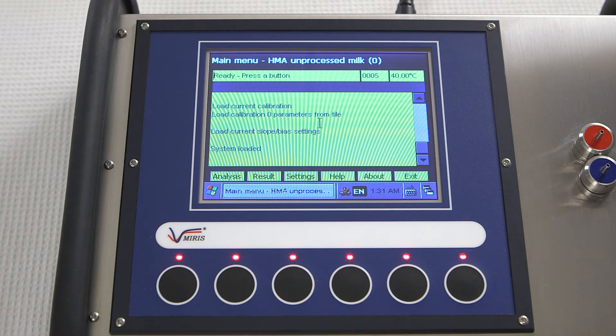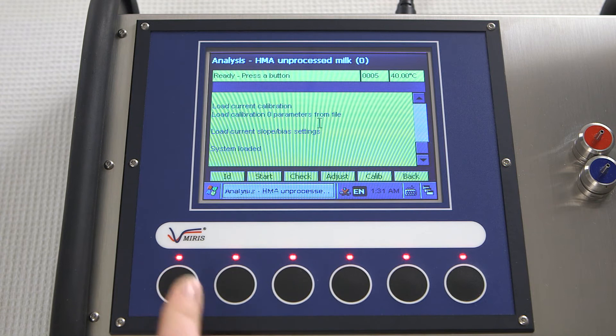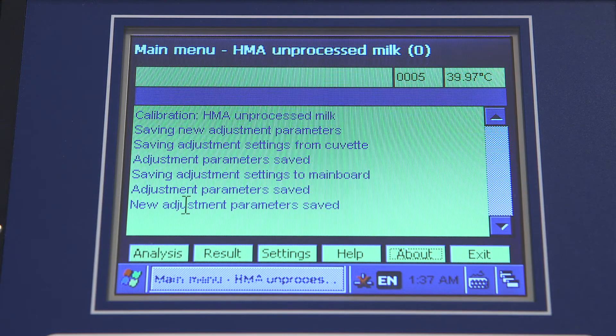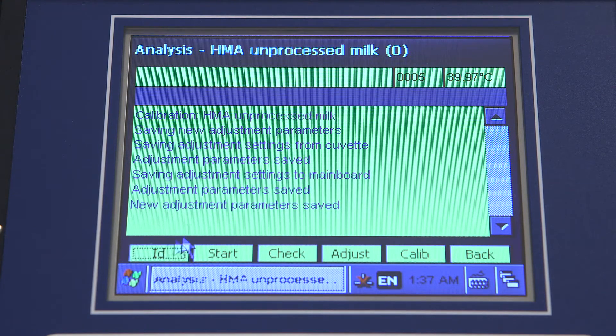After cleaning, press the analysis button and select the analysis mode for your samples. You can choose between modes for either fresh unprocessed milk or thawed and homogenized milk.